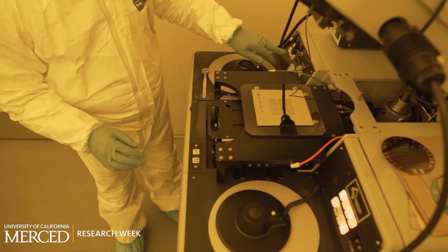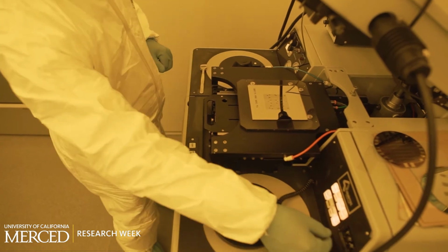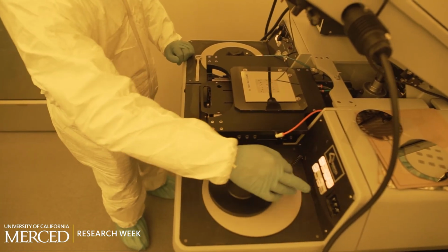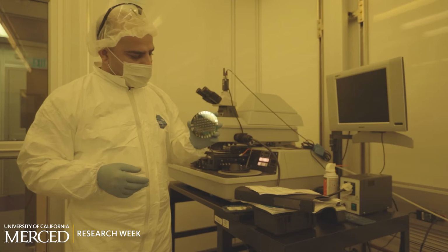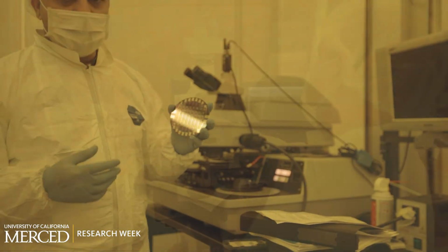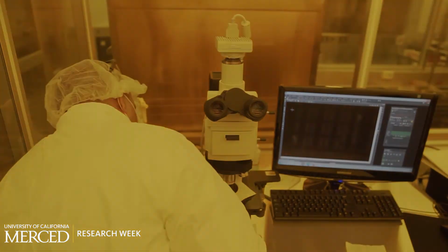Then we expose the deposited photoresist using a UV light through the mask. We are using a positive photoresist. That means the area which are exposed to the light gets soft and dissolve easily in a solvent called developer. And you can see that the pattern is now printed on a silicon wafer. Now we can use Nikon microscope to perform analysis of the deposited pattern.